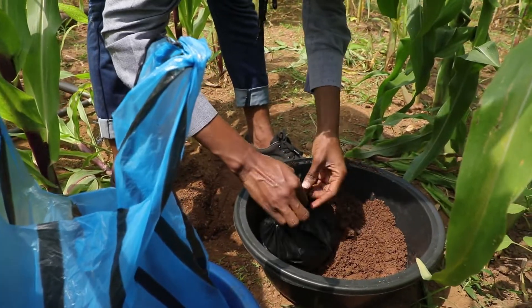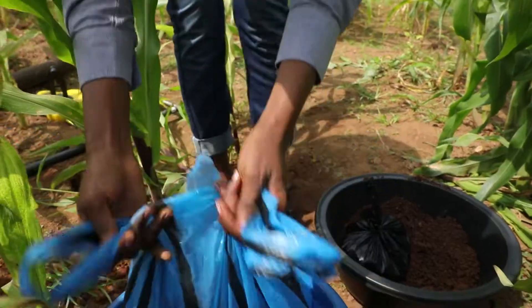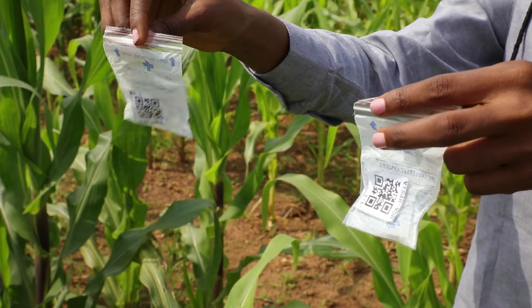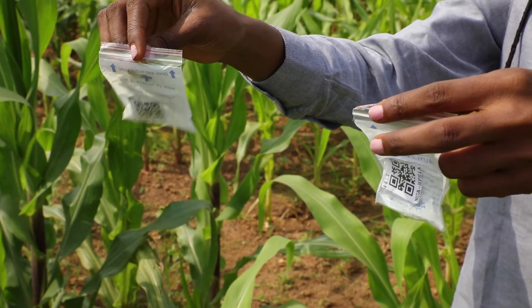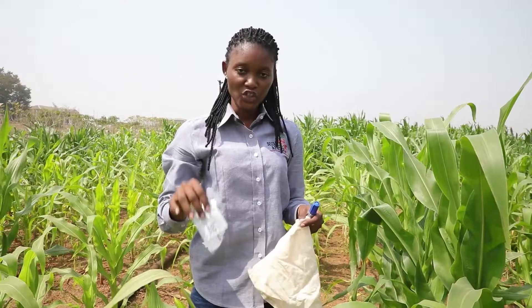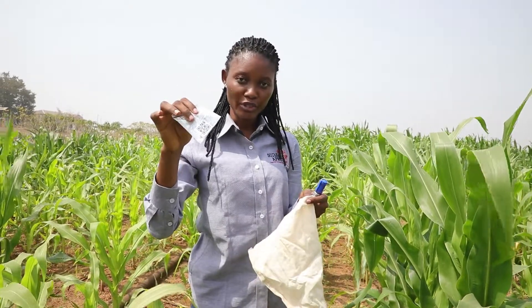Tie the bags properly or staple them if they are thick enough. Then scan the barcodes with the smartphone in the right section of the ODK form. Put the codes into the plastic pouches and put the pouches into the cloth bags.